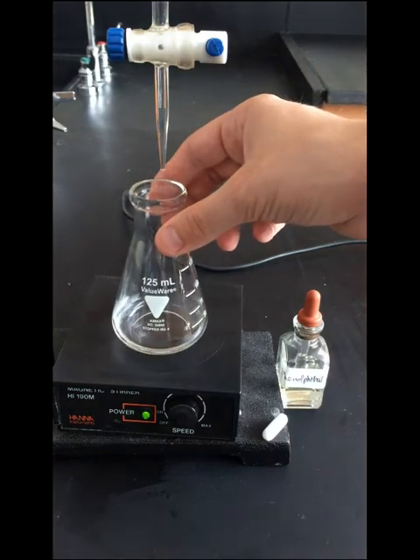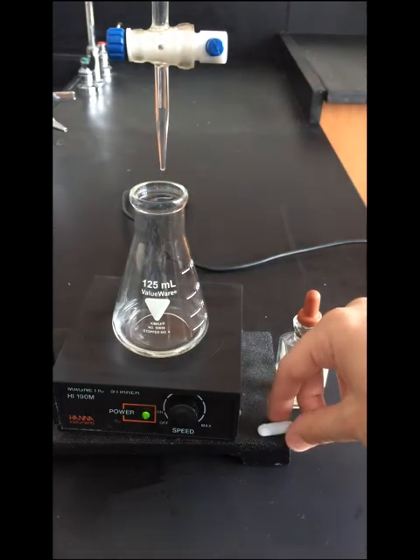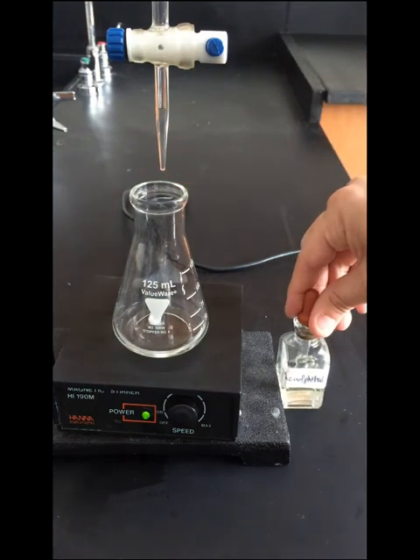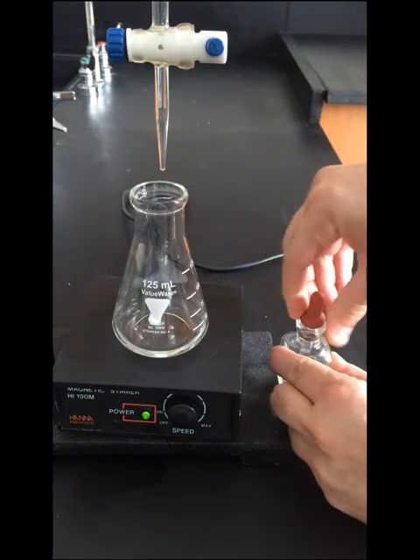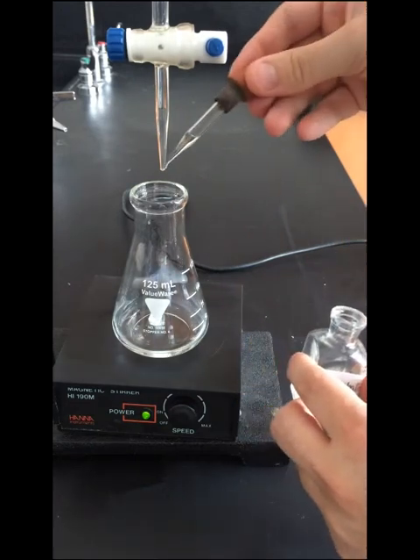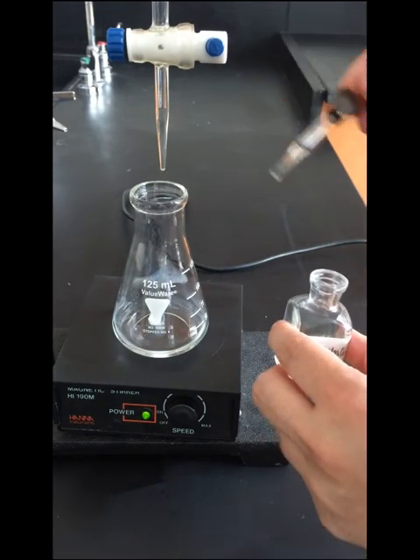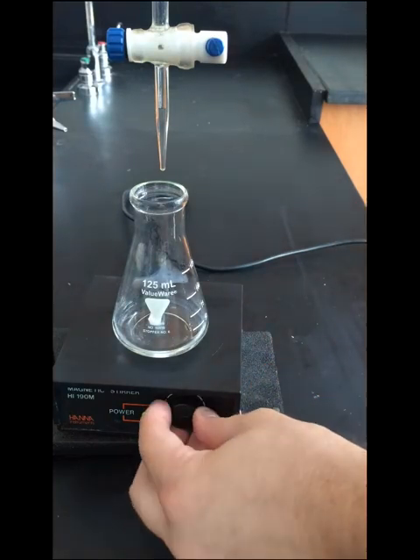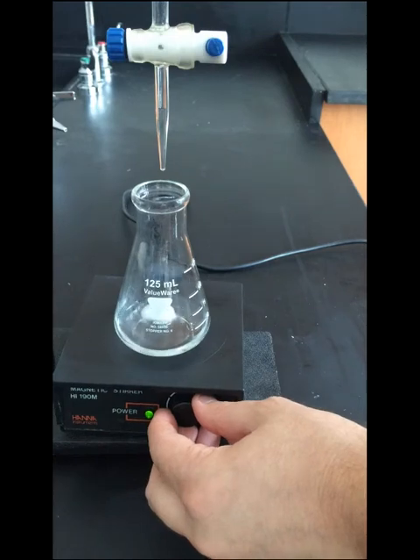The flask is placed on the magnetic stir plate. The magnetic stir bar is added to the flask. And then 2 to 4 drops of phenolphthalein is added to the flask. This is used as an indicator. In the presence of a base, it will turn pink. Notice that in the presence of the acid, the vinegar, it is clear.